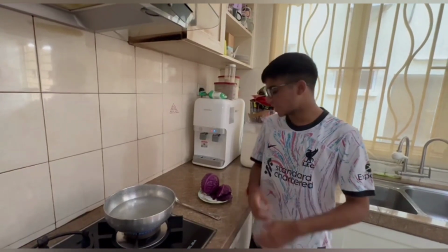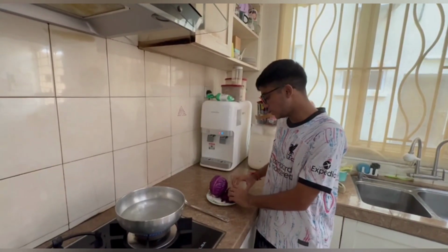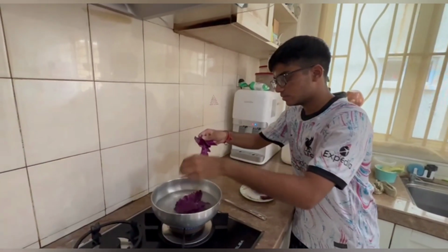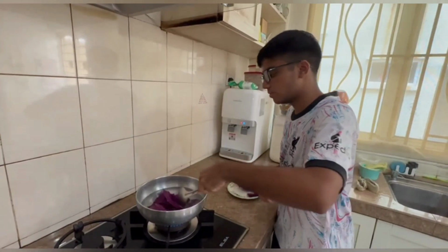To prepare the red cabbage solution, first we need to obtain about 2 to 3 leaves of the red cabbage. Firstly, we need to put this red cabbage into a hot water boiling pot to ensure it boils. For this, we need to stir it to ensure the heat is evenly distributed.